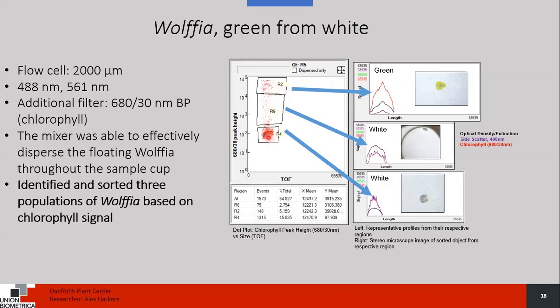What are these? What RNAs are being expressed? Do histoimmunochemistry to see what cell surface markers are being expressed. How are these different from each other? And start characterizing them, or put them under different growth conditions. See if these can be converted into these, see if these get converted into these, and what biology is happening.